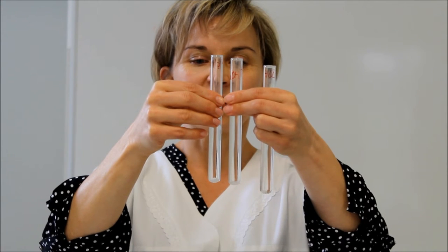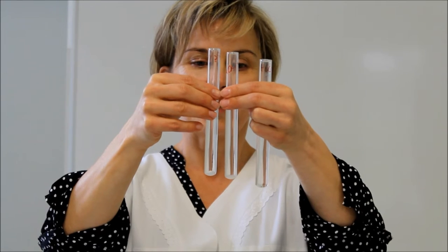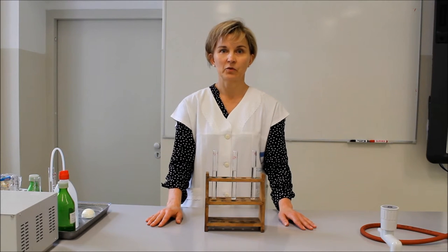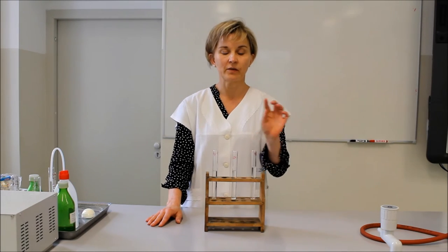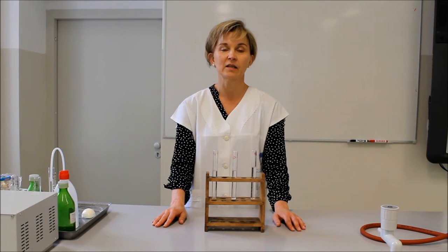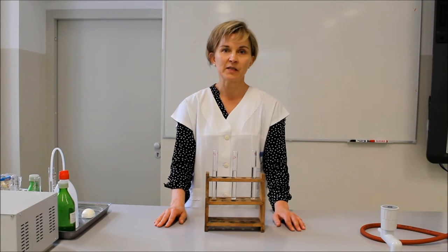A vizes kémcsőben nem történt változás a fehérjénkkel. A lúgos közegben szintén ezt tapasztaltuk. A pepszin fehérjébontó enzim, amely savas közegben fejti ki a hatását. Ezért a sósavat és a pepszin oldatot tartalmazó kémcsőben a fehérje mennyisége csökkent, ugyanis a pepszin a fehérjét kisebb egységekre, oligopeptidekre, dipeptidekre bontotta le.